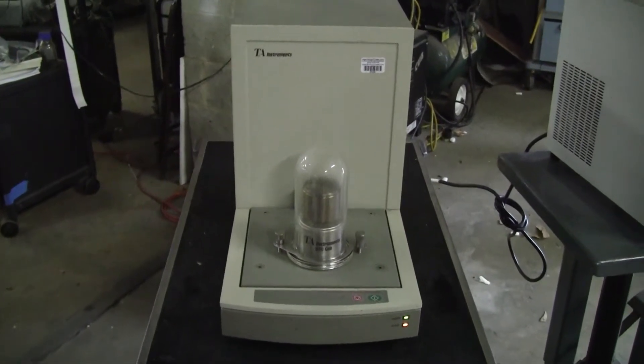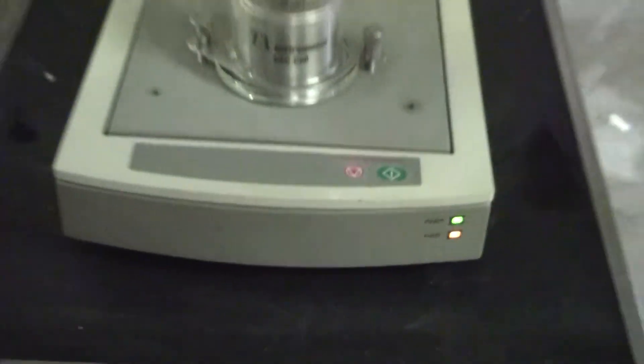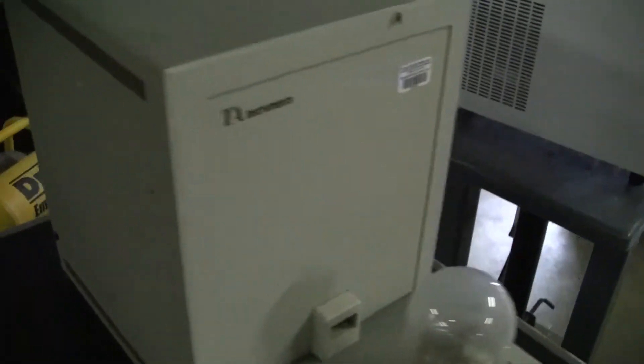Good afternoon from HiTechTrader. This is the TA Instruments DSC-2010 Differential Scanning Calorimeter. Two buttons work. Ready light is on. Before we show you the chamber, I'll show you the rear of the unit.